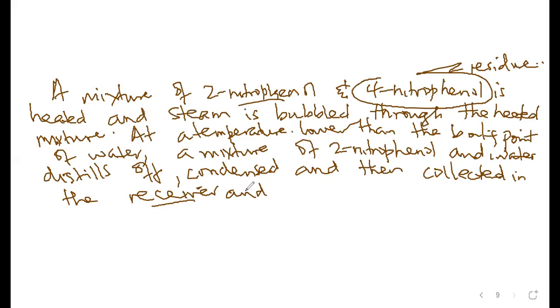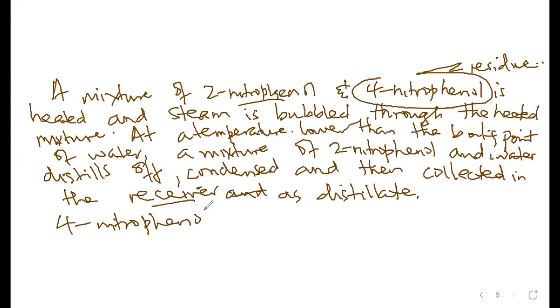Yes, teacher. The 2-nitrophenol and water are collected in the receiver as distillate. 4-nitrophenol remains as the residue. Are we together? So our 4-nitrophenol remains as residue.